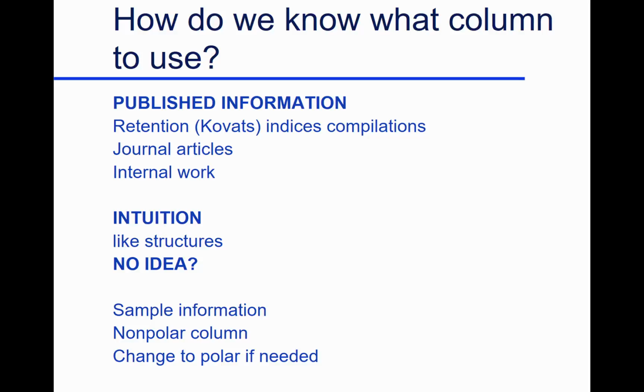Oh, that sounds interesting. Sure. What do you know about it? Well, it's in my drywall. Okay. So you do some extractions of it, and you smell each of the extracts. And this one extracts the smell. You concentrate it, you clean it up, and you run it on the gas chromatography. You don't have the faintest idea what it is.